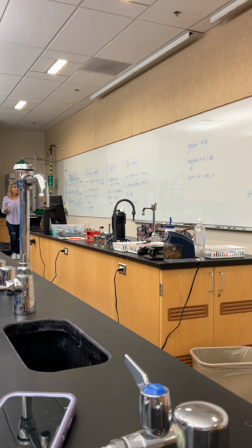So if I was to stain these, I wouldn't be able to tell a difference between them. So using this type of media is a way that I can quickly determine differences. Do y'all remember that book I showed you at the beginning of lab called the Bergey's Manual, and I flipped it open and there were all those tables inside? Those tables are showing when we're having sugar reactions.